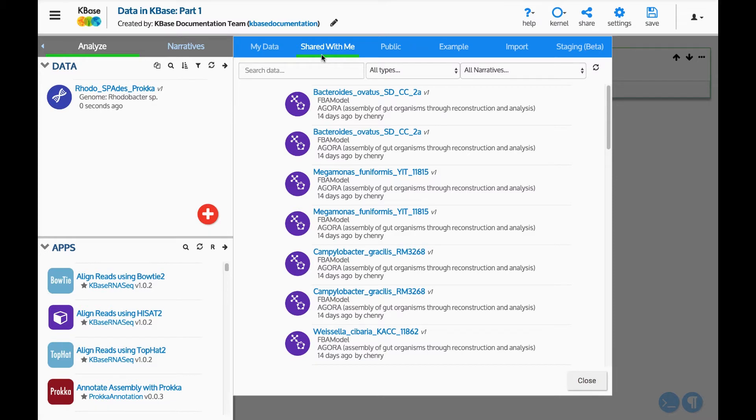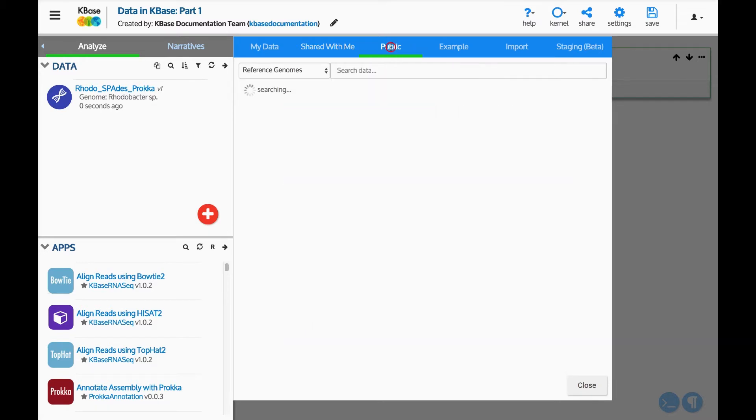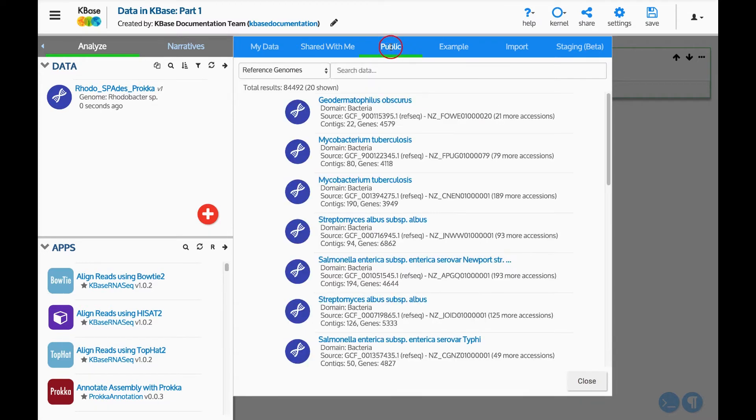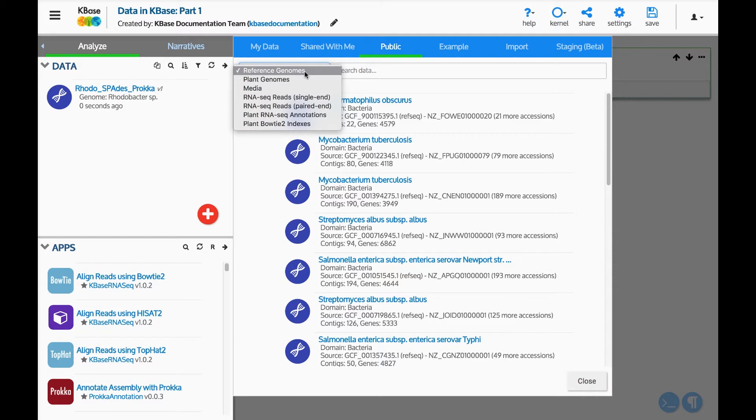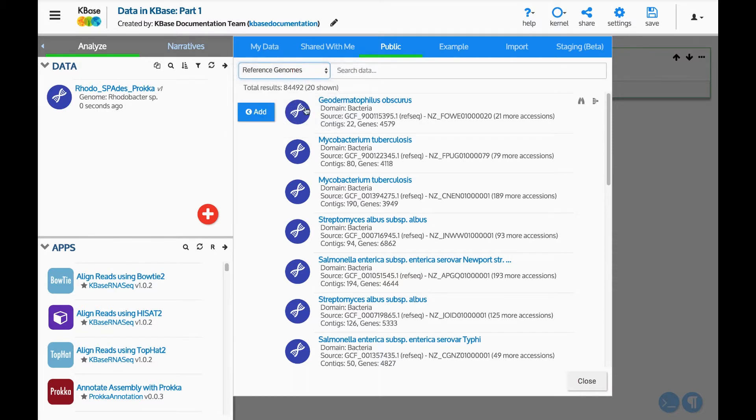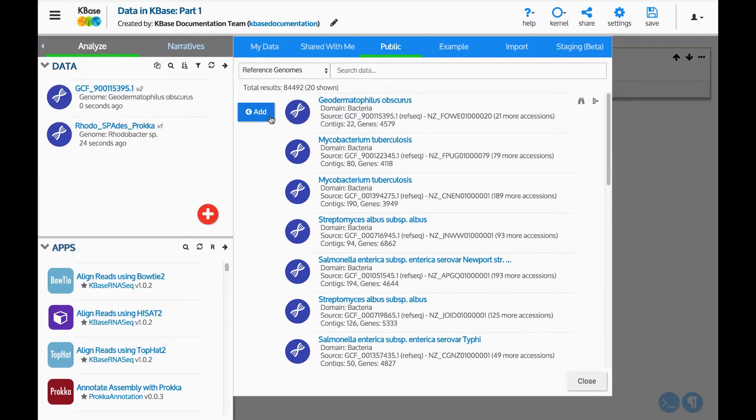The Public tab provides direct access to public data that KBase periodically imports from several sources. Use the drop-down menu to select the type of public data to display. Let's add a genome from the reference data. Once it is added, you will see it shows up in our data panel.